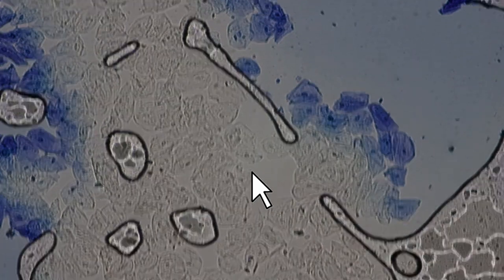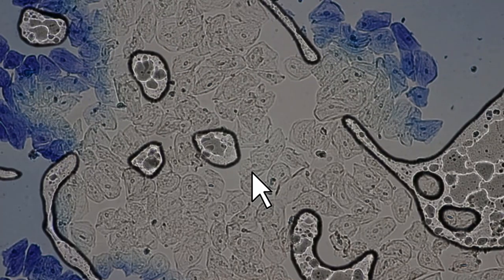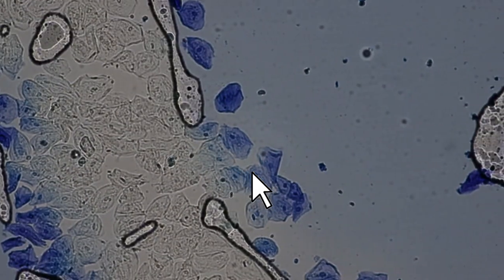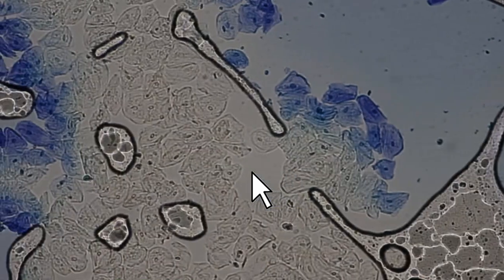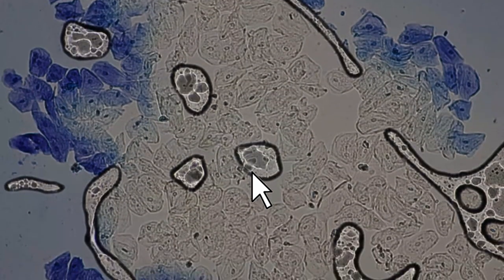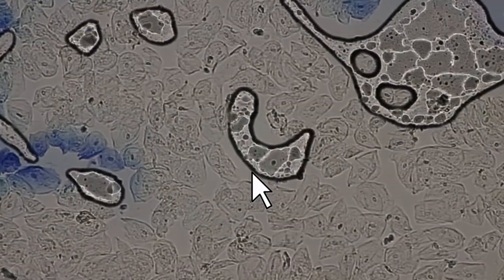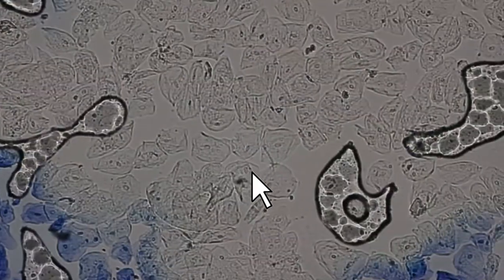Or, next hypothesis, maybe the stain also is in the middle right now, but maybe only the liquid part, because all of the methylene blue itself has already been removed by the outer layer of cells here. So this could be another explanation. Maybe even the liquid of the stain has also reached the center here, but all of the stain, the methylene blue itself, might have already been removed by the outer cells. Hypothesis, hypothesis, hypothesis. I have no idea.